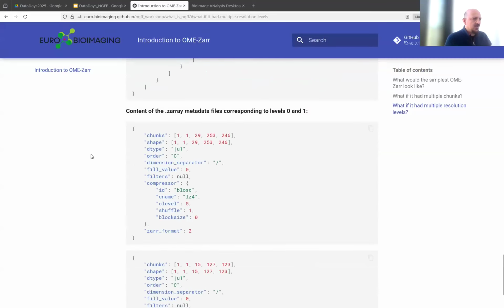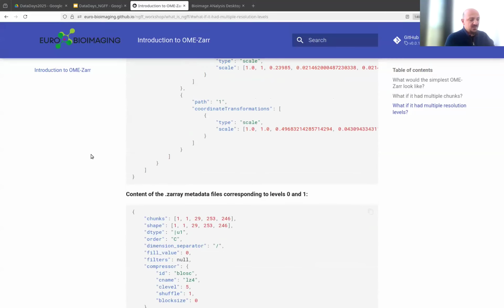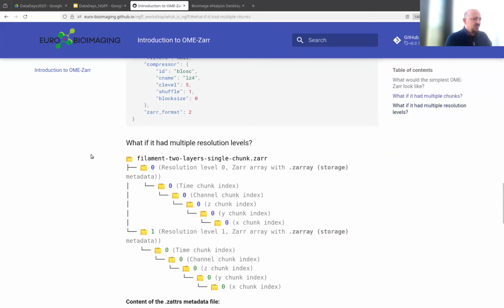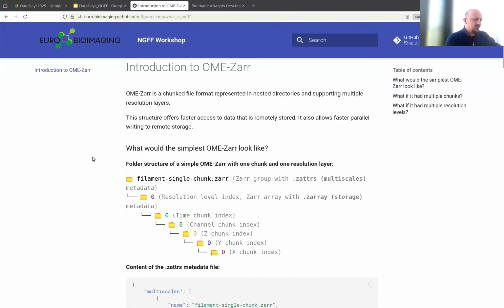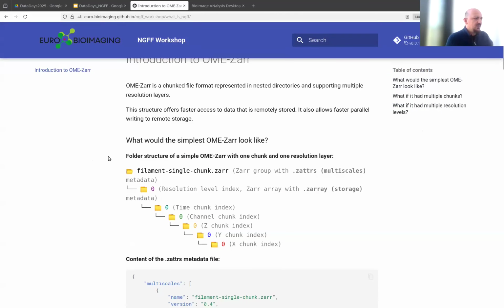And basically, that's the simplest scenario for OME-Zarr. And of course, there are factors that make it a little bit more complex. For instance, you can also store label images, segmentation labels in the same hierarchy, or you can definitely have more metadata fields such as visualization metadata. You can also store visualization metadata in OME-Zarr. So I'm not demonstrating those here.